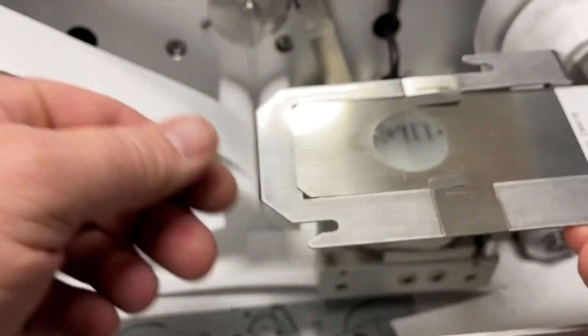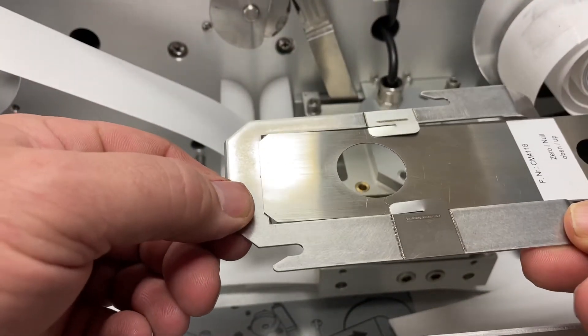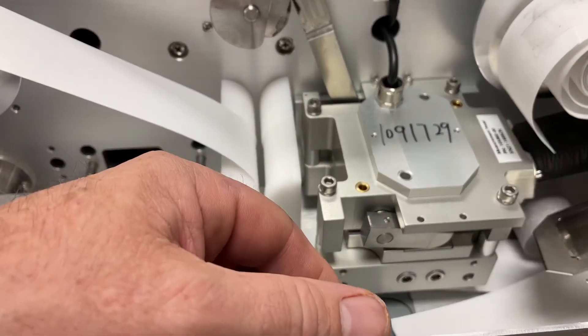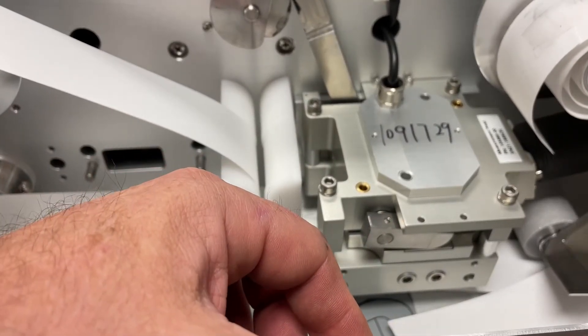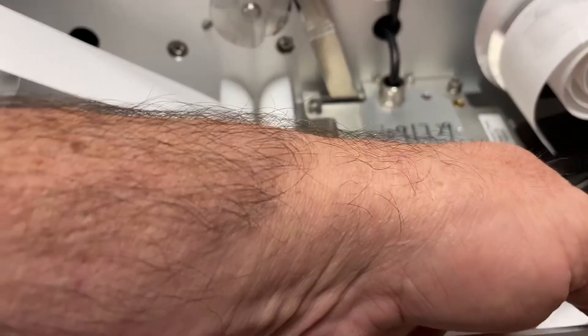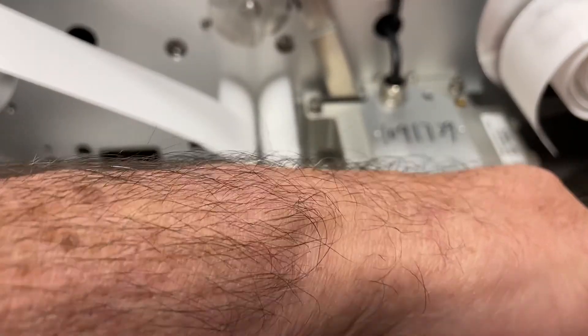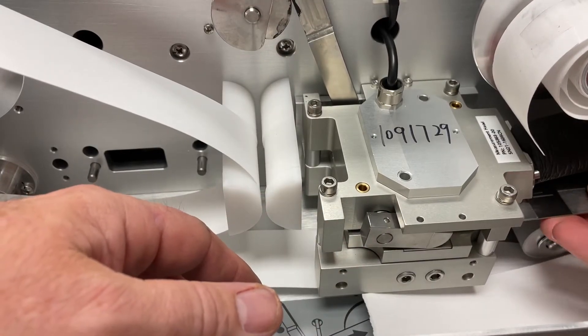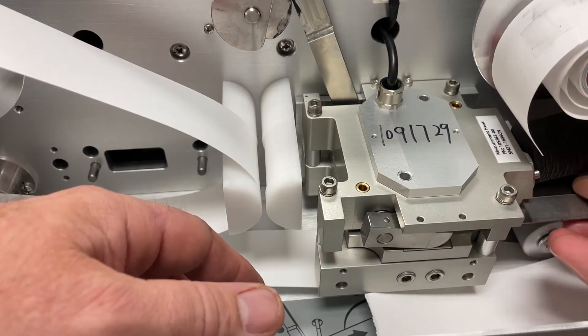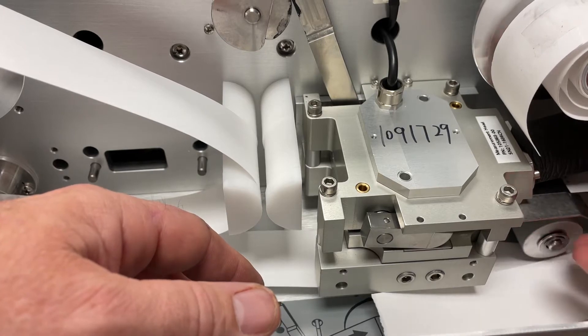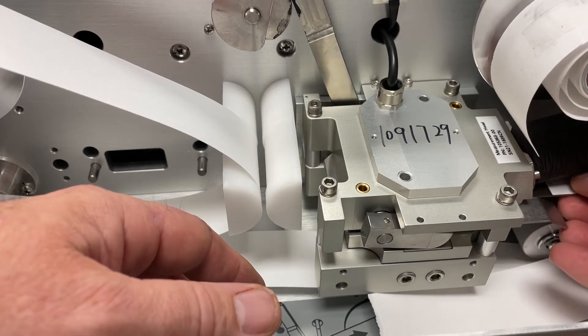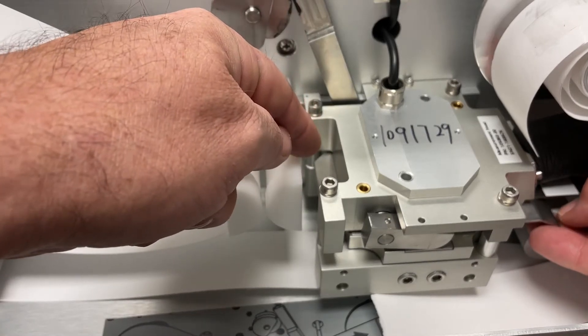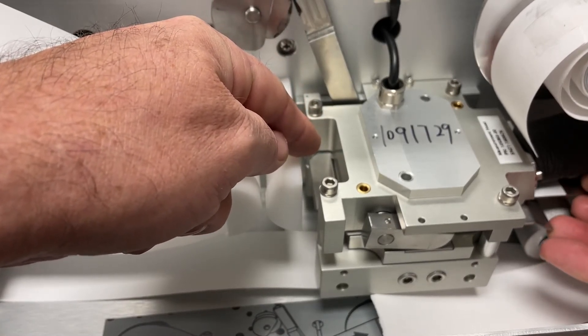Once that is out, we can take our foil that we've inserted into the plate. Now we're going to insert it into the head assembly, going in on the right side and just gently easing it in to the assembly, and it will stop.